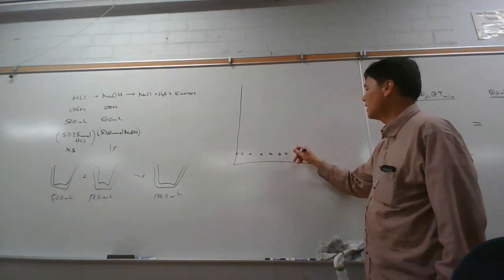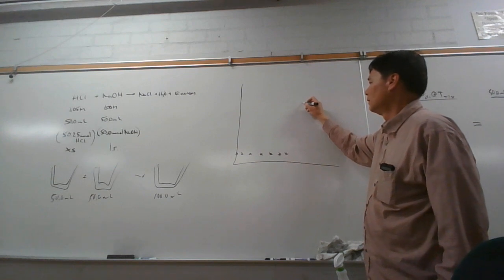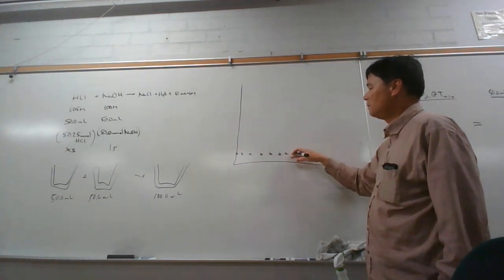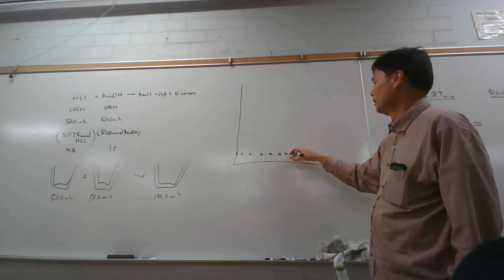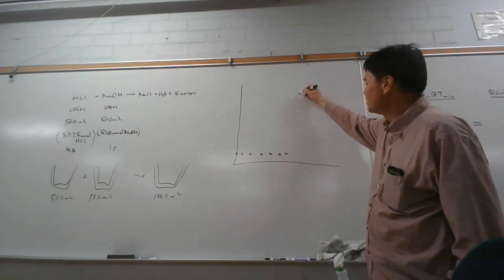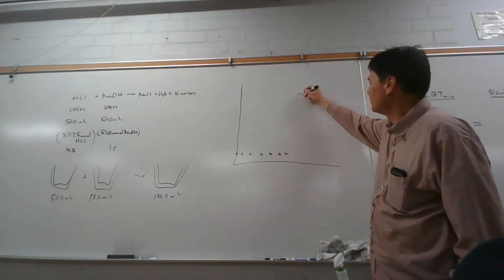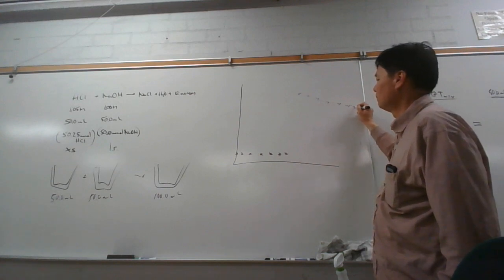Okay, when you mix them together, what happened to the temperature? It drops. Well, these are kind of already at room temperature. It became hotter than the original too. Okay. Actually, the temperature should have increased, I think, and then started to cool down.